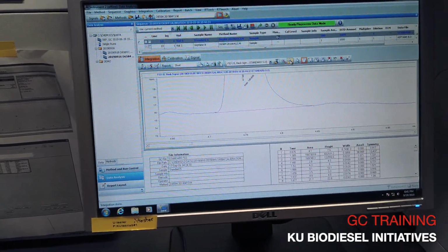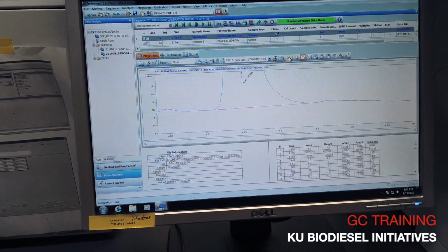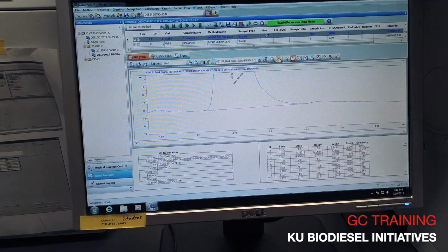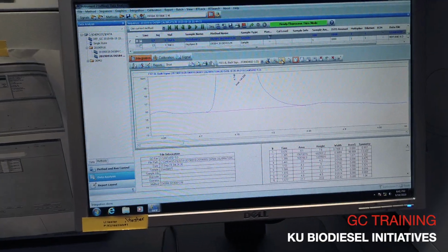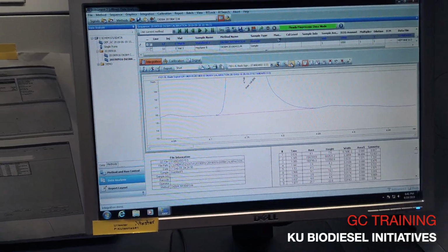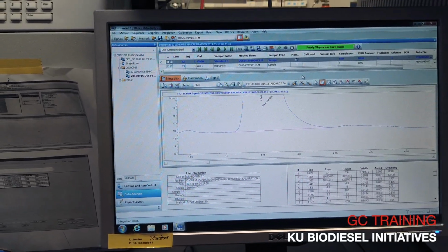Now, it depends on whether Dr. Williams wants you guys to start doing in-process biodiesel or not, but if all you're going to be doing is finished product, there's going to be very little differentiation. It's all going to look the same. So it'll be fine.